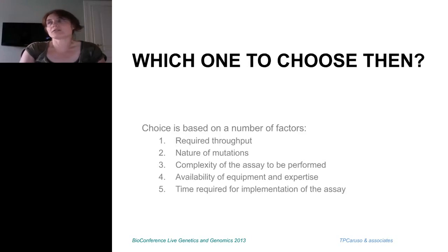How many tests are you going to do per week? Are you going to do 10 tests, or are you going to do 100 or more tests? If you're going to do a lot of tests, that probably microarrays might be a little challenging, but not impossible.